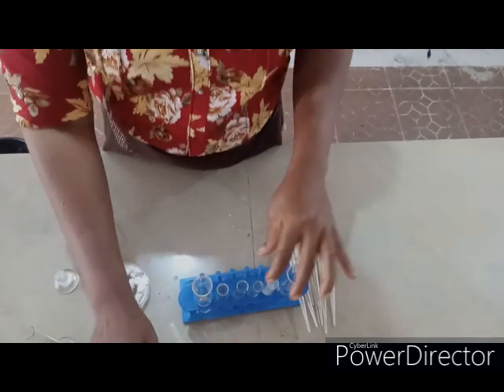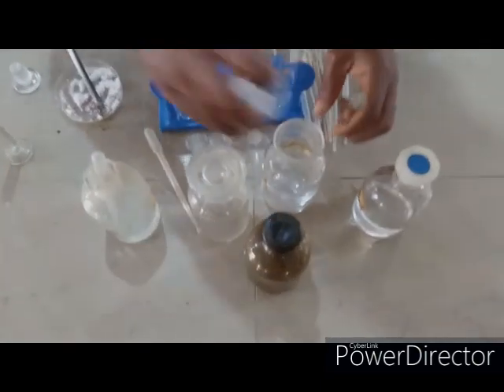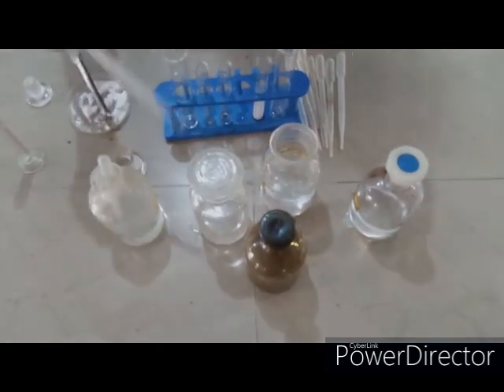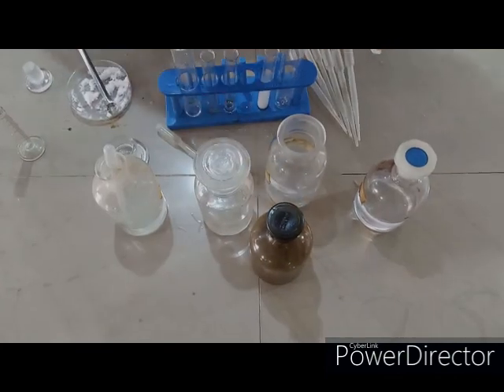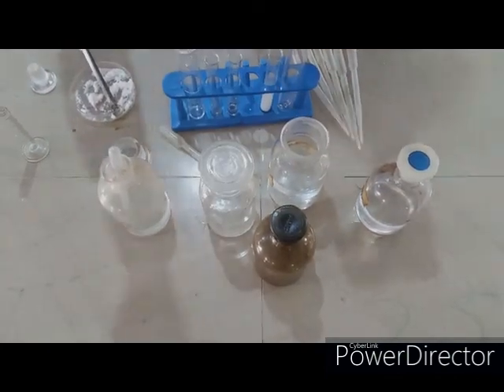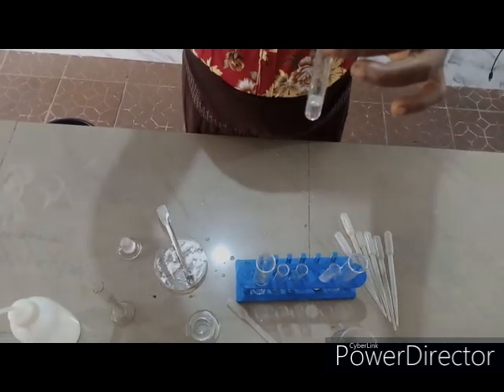Now to the second portion of the solution, add aqueous ammonia. In drops, add in excess.